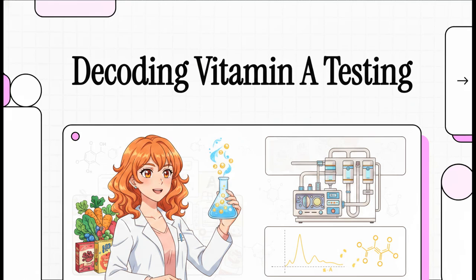Today, we're popping the hood on analytical chemistry to see exactly how we measure trace vitamins in our food. We'll be walking through the complete experimental details for estimating vitamin A in complex food samples. It's honestly a fascinating game of molecular hide and seek.